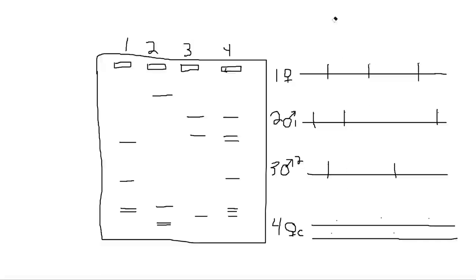Now we look at the child. The child's DNA, we can cut using that same enzyme. It's going to cut at the sequence it recognizes. And this is what we get. Now let's go over to the gel and see what we have. In spot 1, and I've just drawn the symbol for female, so we have the woman, and the symbol for male here for these two. We have 2 males, and we're asking the question, which of these 2 is the biological parent of this child?